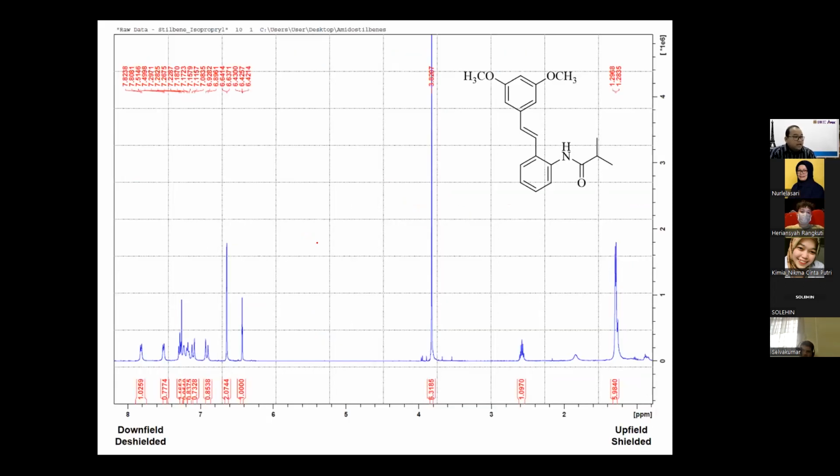Here is the NMR. If you assume this kind of compound, what you can have here is around OCH3. If you have a heteroatom, it is shifted to the downfield region. But you have two integrations here. The OCH3 times 2 becomes 6 protons.